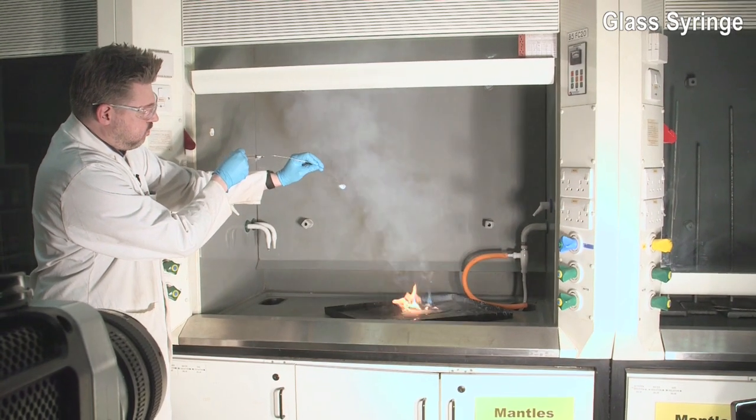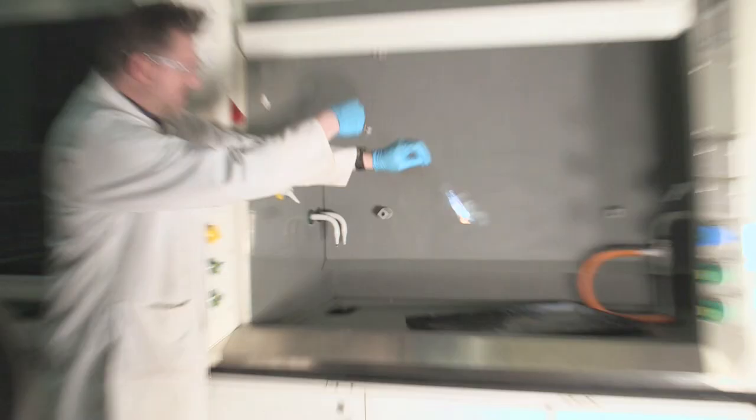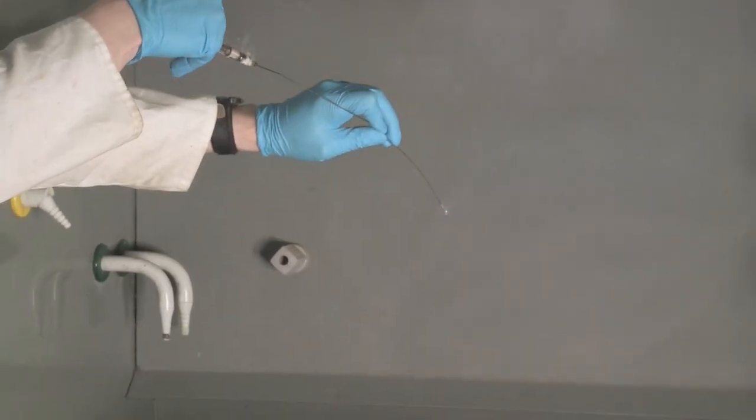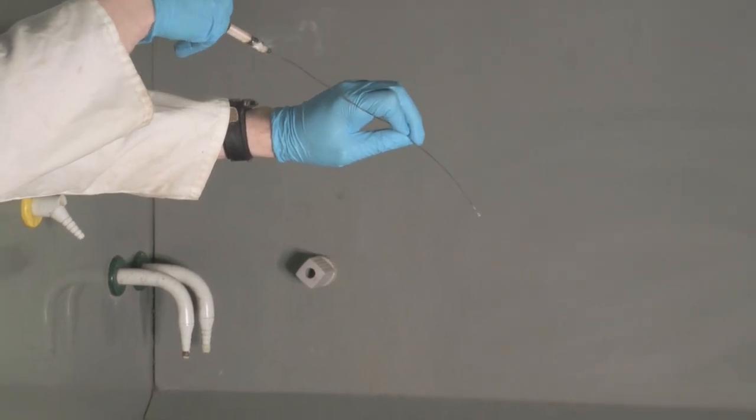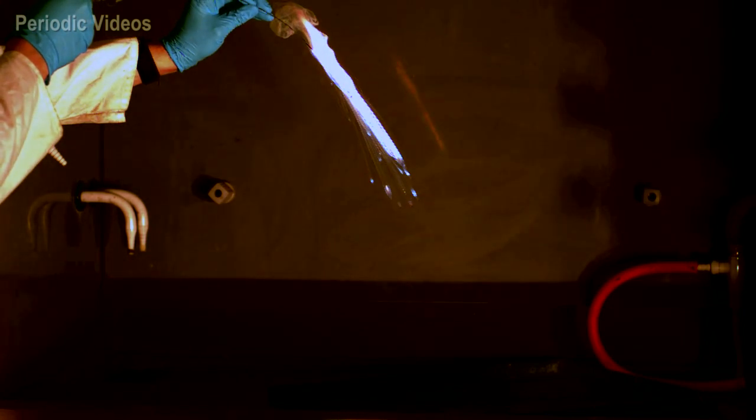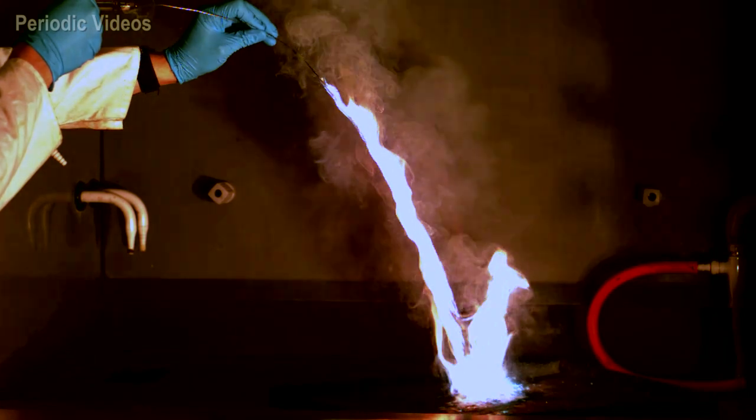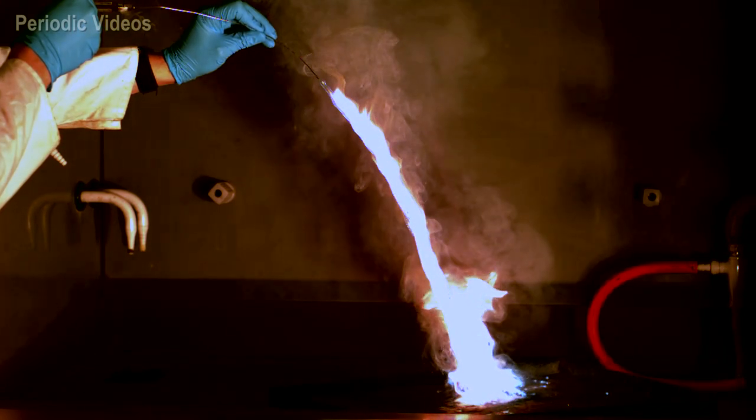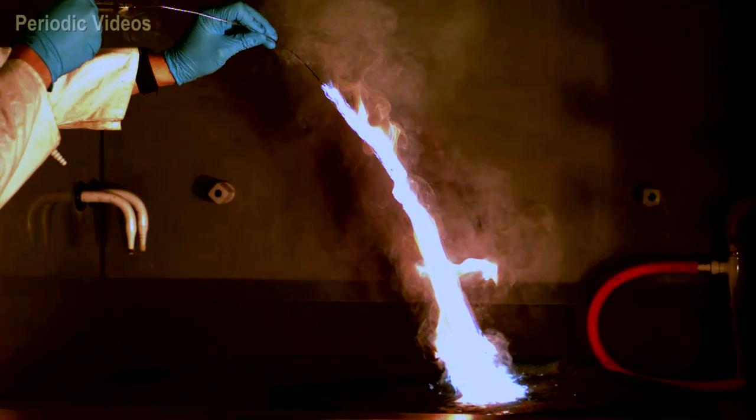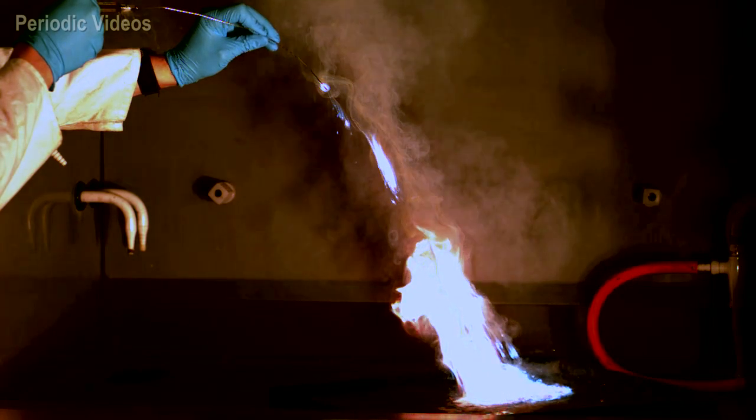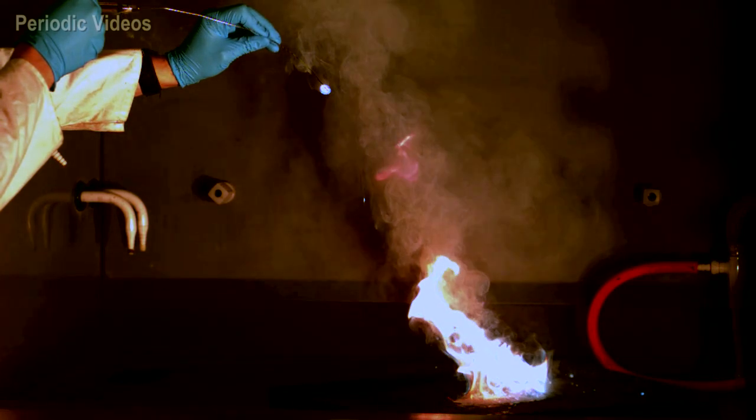Now I think it's time for the control experiment where we go back to the original glass syringe and see if there's a genuine difference or not. Well, I saw blue in that one as well. I'm a little surprised by that.